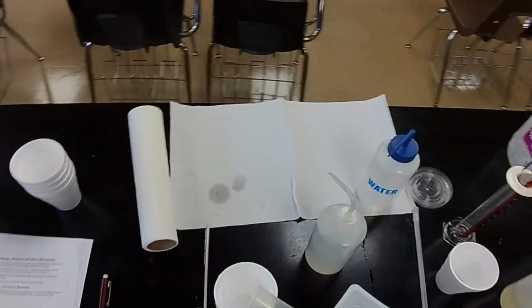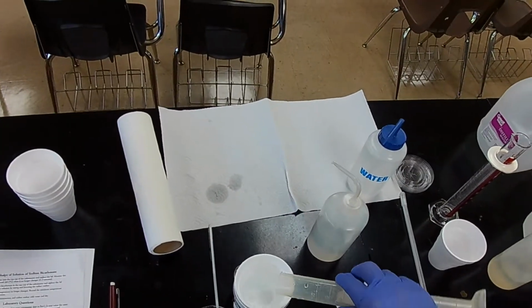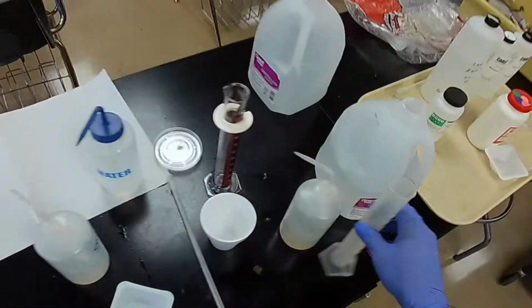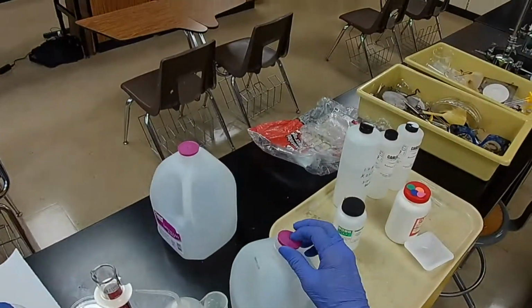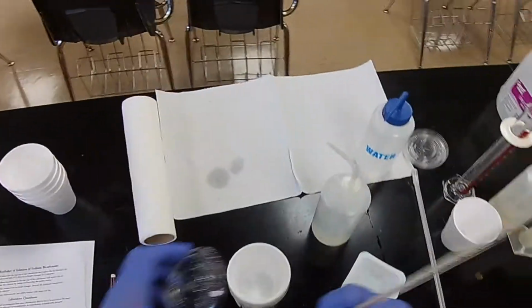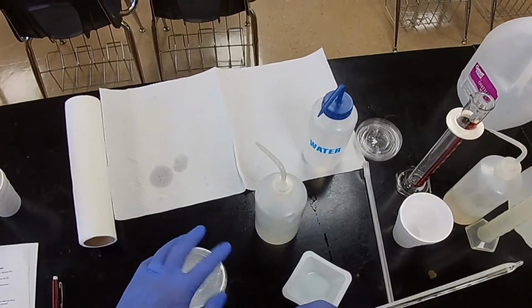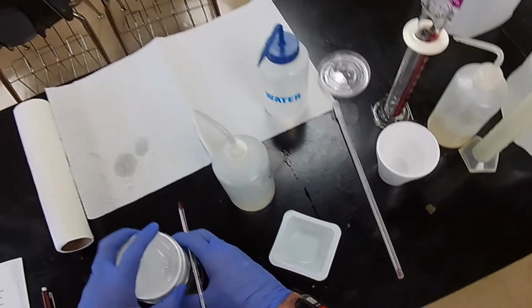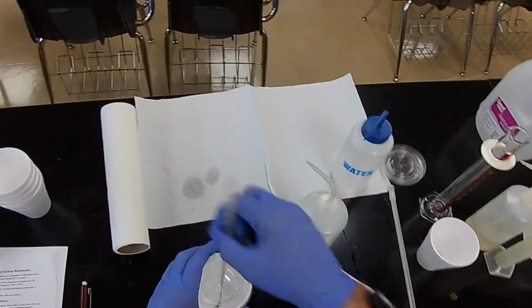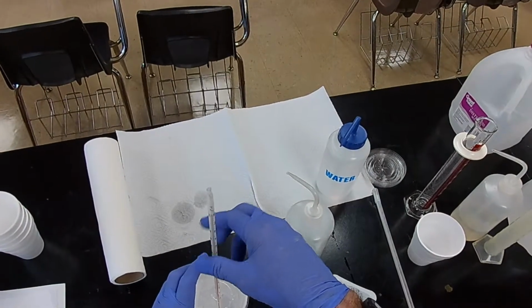There we go. 75 milliliters of water. And we'll rebuild our calorimeter.